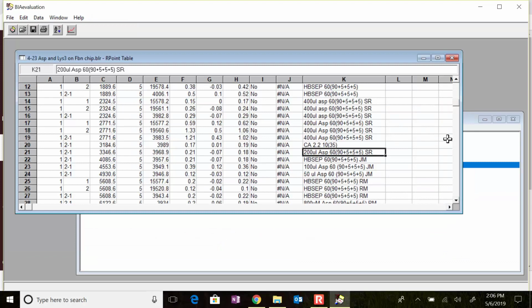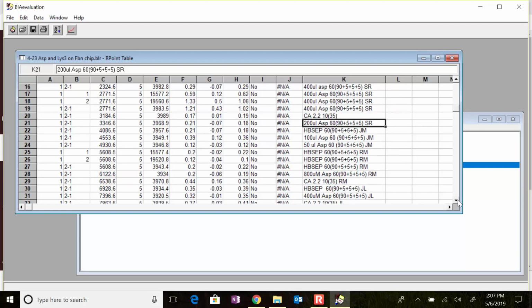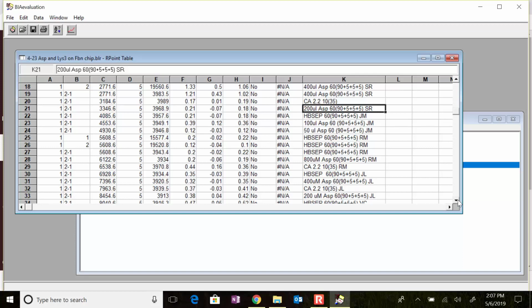Okay. So the one thing to be sure of, it's easy to open up too many project windows that display your data, and always just close it back out if things are getting confusing. You know, opt toward closing it out. Let's, oh, we've got 3 more to do, and we've still got another ASP and another ASP there. So I think that we can do a complete set of data if we just go through.